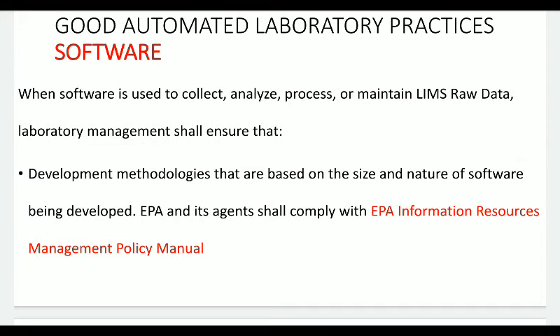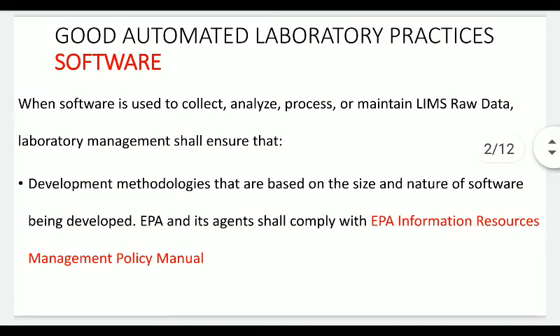Who will purchase the software for LIMS? It is the job of laboratory management. And from where will they purchase? From a list of contractors approved by EPA, that is Environmental Protection Agency, or USFDA. These are authorized persons to purchase LIMS software.